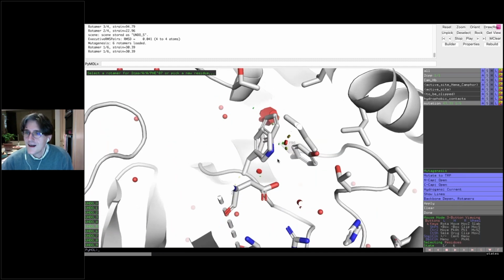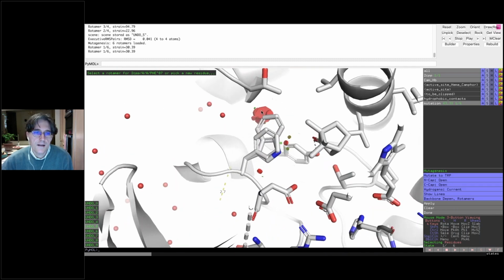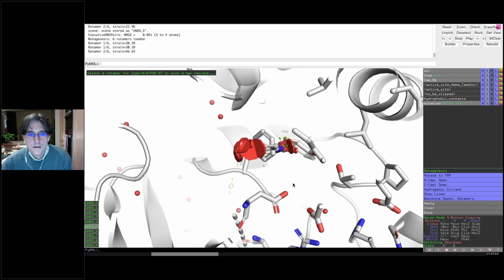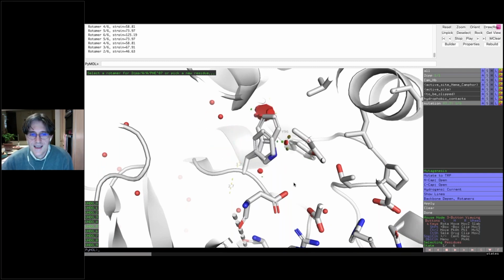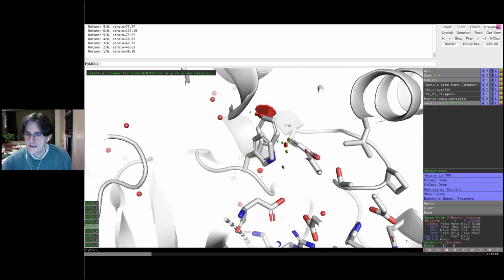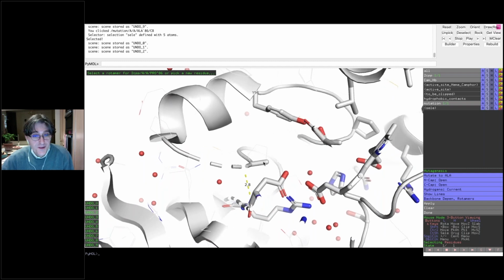now it's automatically selected the one that fits the best, and it's still not great. There's some nasty clashes up here, and if I step through the others, you'll see that they are not happy. So that is never going to work. I probably wouldn't want to ask my molecular biology friends to go away and make that sequence. Okay, well that's mutagenesis for you.